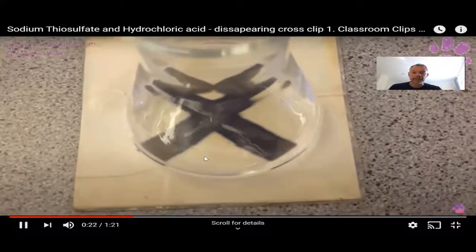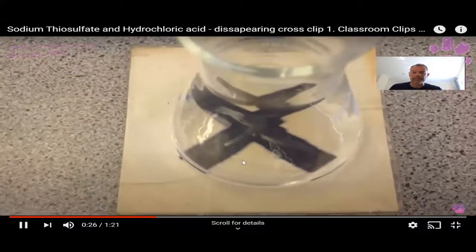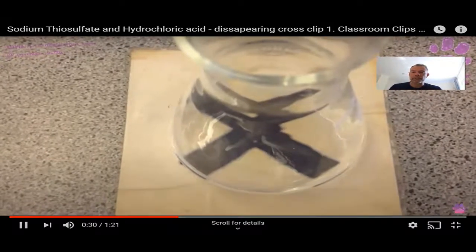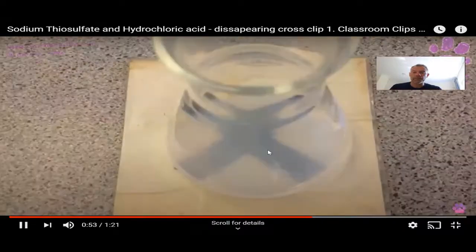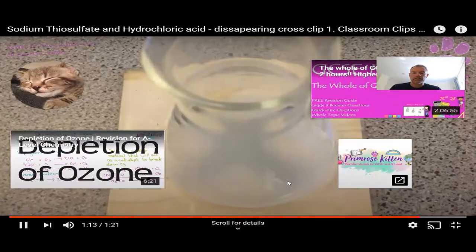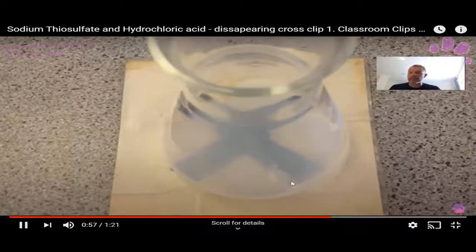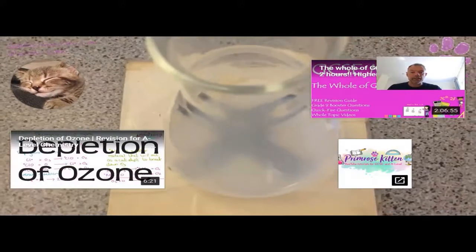Okay, and as we're watching, can you see it's starting to go a little bit cloudy around the edges? It might help to give the conical flask a little bit of a swirl. It's starting to go a little bit cloudy. The clock will be sort of ticking. If I ping the video forward a bit, look, it's getting cloudier, getting cloudier. You're looking down, and at some point you have to make a decision as to when it's so cloudy that you can't see the cross anymore, and that will go on and on until you can't see the cross anymore. Then you stop it.